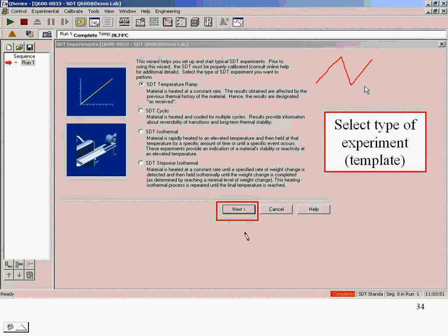When we're done with this page, we make our choice, then we click Next. And we're going to go through this on all the different pages. I'm not going to keep telling you to click Next, but that's what happens. Pretty self-explanatory.